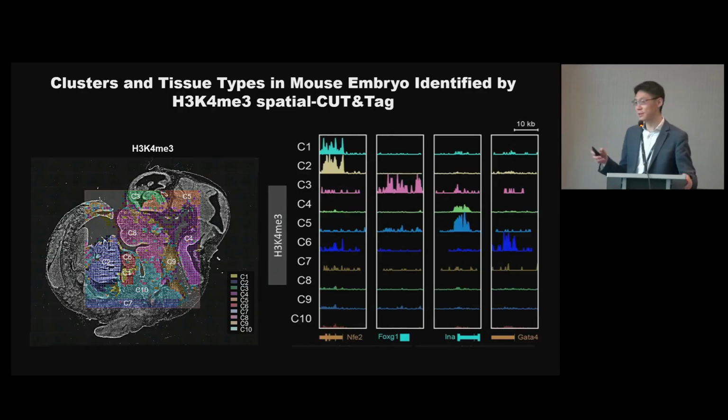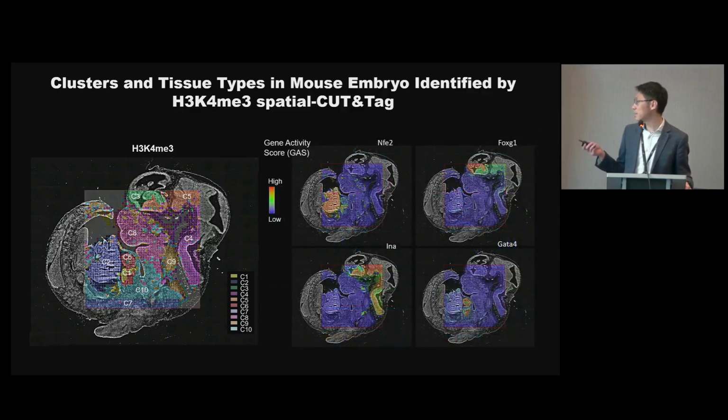Again, this is genome-wide sequencing. You can map out where the peaks are, and you can visualize the location of the peaks in relation to individual genes to look into the promoter activity, the peak interaction, and so on and so forth. We haven't done that much, but the data is extremely rich. If you're interested, you can look into a lot of mechanistic epigenetic regulation. After you look at those genes, you can also go back to visualize where they are. Just to show you a couple of those. But keep in mind, this is not a spatial gene expression map. This is also not a spatial accessibility map. This tells you whether or not that particular gene in this particular organ, for example liver, is associated with this specific histone modification, this particular epigenetic mechanism. So altogether, what you learn here is the epigenetic mechanism. All right.